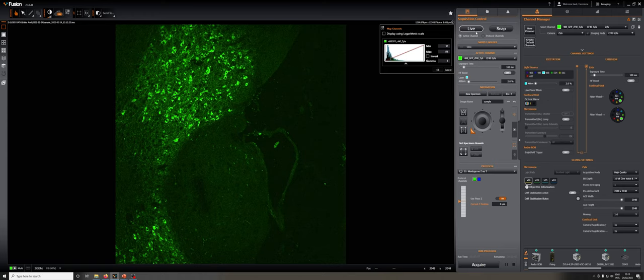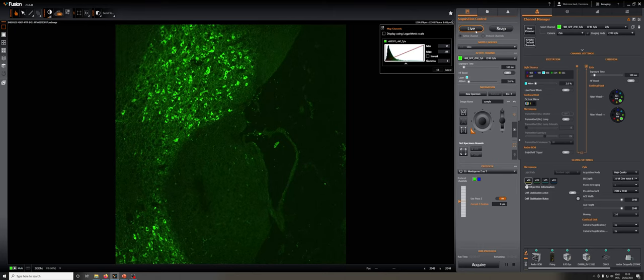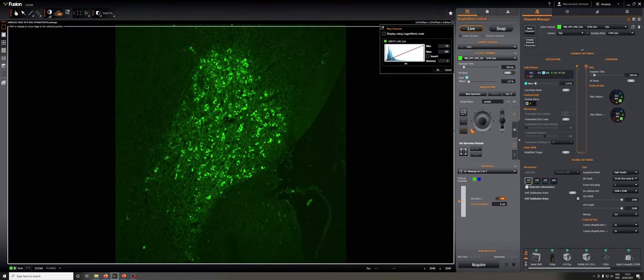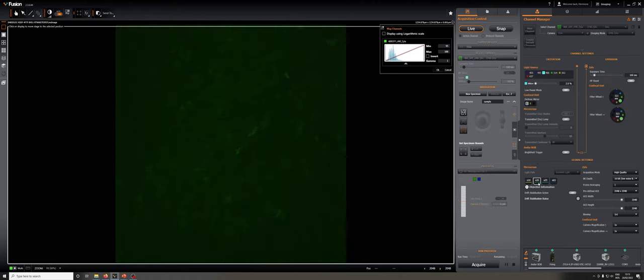I'm going to check whether our sample is in position, so I'm going to go to live. It is. I am going to center this area with a lot of cells, and I am going to switch to the 20x objective so that we can get a slightly higher resolution image.